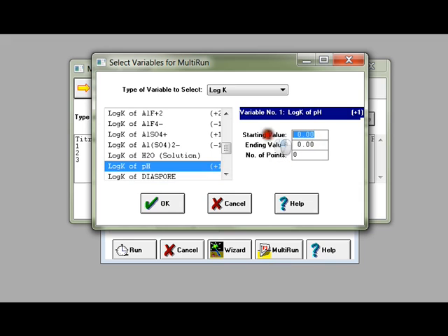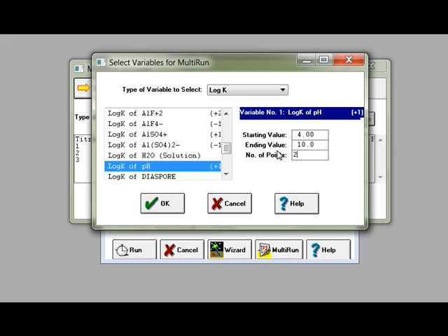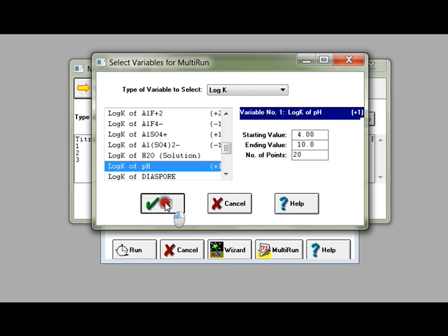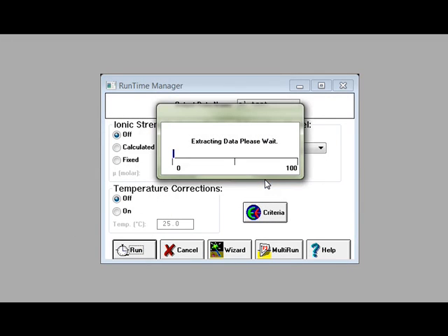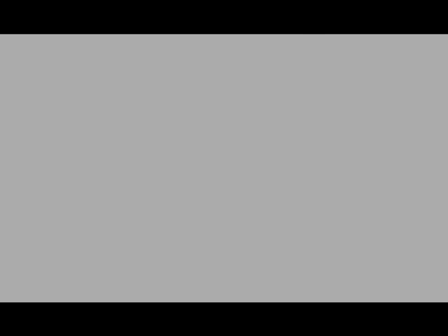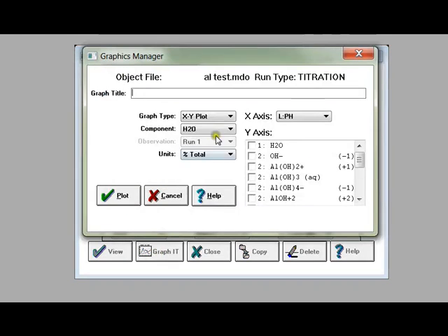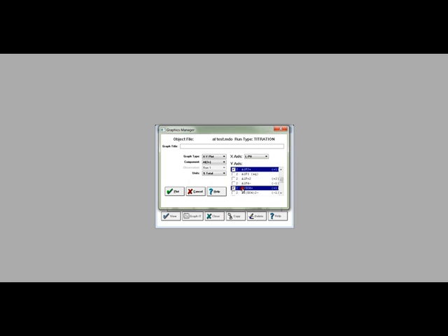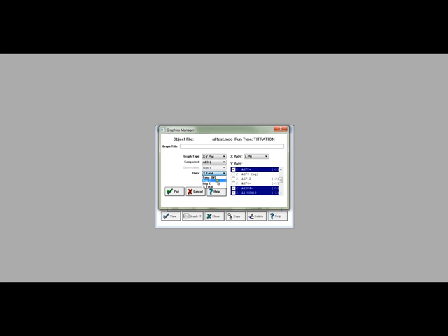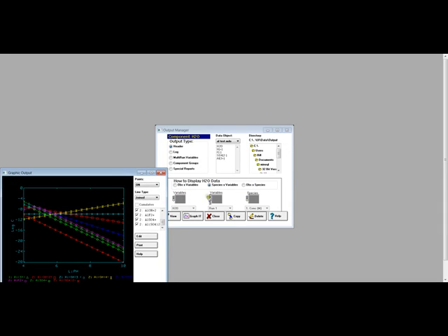Then put in the starting and ending values and the number of points you want in your calculation. Press OK and OK again. Now if you run the calculation, you are creating a series of runs all at different pH values. It's the same as the single run scenario, but with pH changing along the way.